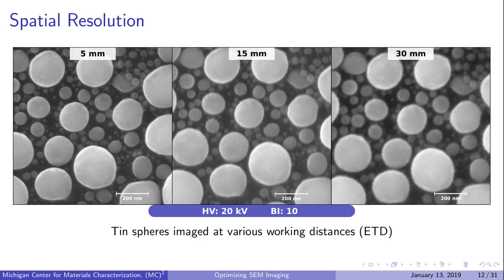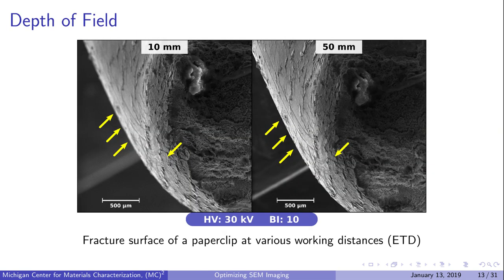Here's a series of images of tin spheres that show spatial resolution decreasing as we increase working distance. The image becomes slightly blurrier at larger working distances, and this decrease in resolution is most noticeable at high magnification. Here's an example of depth of field changing with working distance. At a low working distance of 10 millimeters, we have a shallow depth of field—the edge of the fracture surface is in focus, but the smooth side of the paper clip is out of focus. When we increase the working distance to 50 millimeters, the fracture surface and smooth side of the paper clip are both in focus.